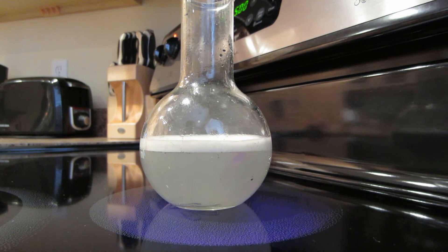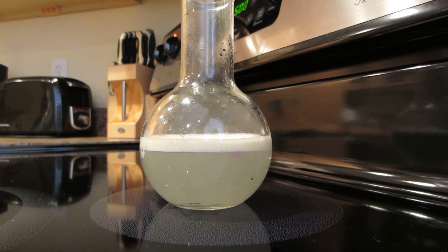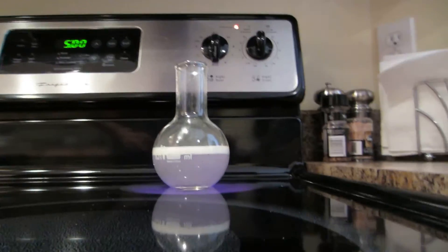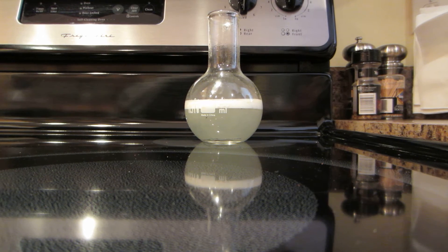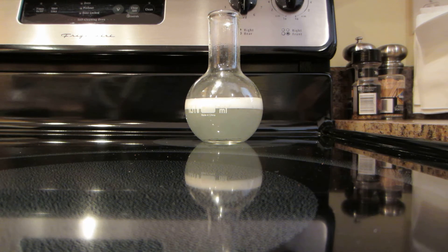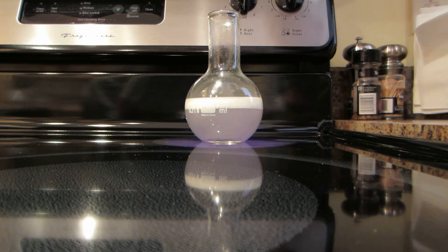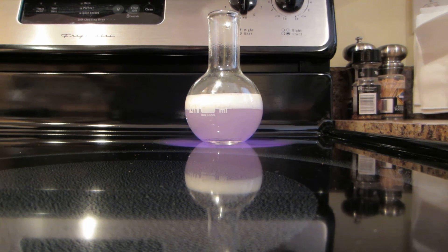You can see it reacting down here. Oh yeah. Definitely seeing steam now. See it rising? Just shut it off. See it rising?